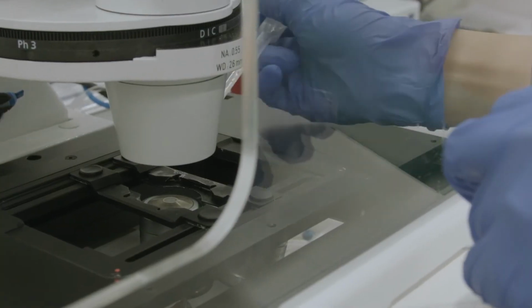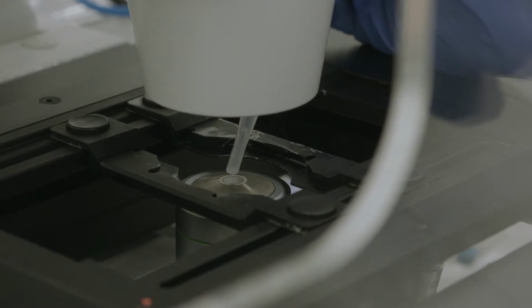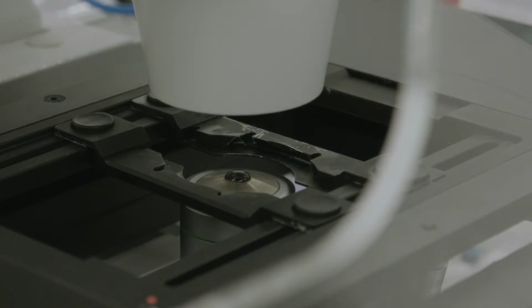So actually, practically, I think that all the confocal microscopes can do the imaging of cleared tissue, but of course you have to be careful of the objectives that you are using. That's true. The meaning of doing tissue clearing is actually to image very, very deep. And if you are using an objective that has a very short working distance, then you lose the meaning of clearing, right? Yeah. Because in the end, you clear the tissue, but you cannot image the other side.